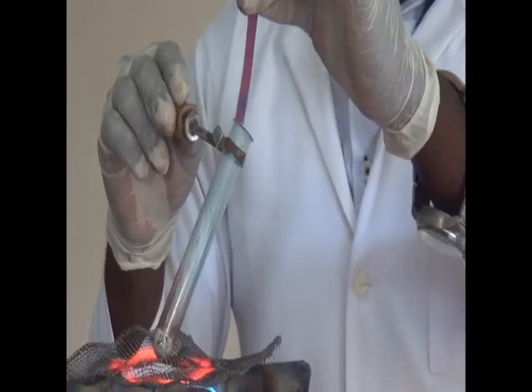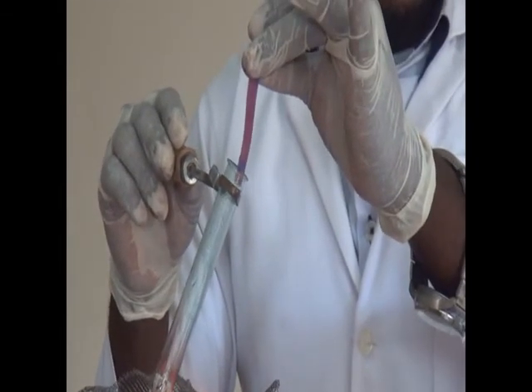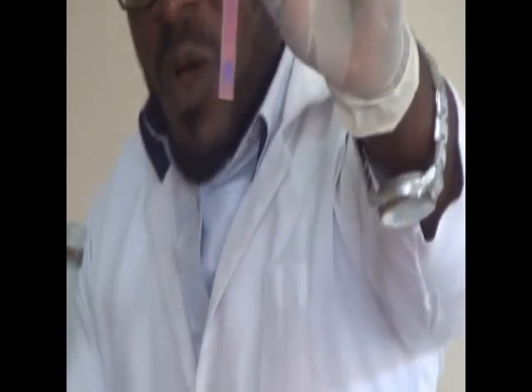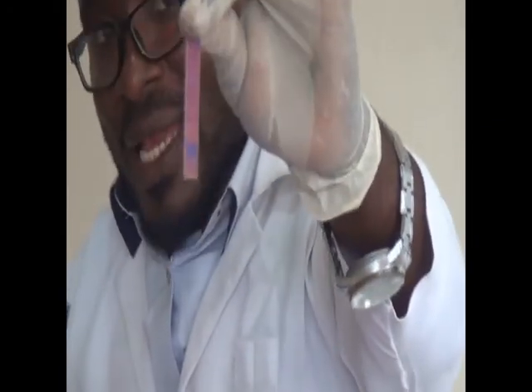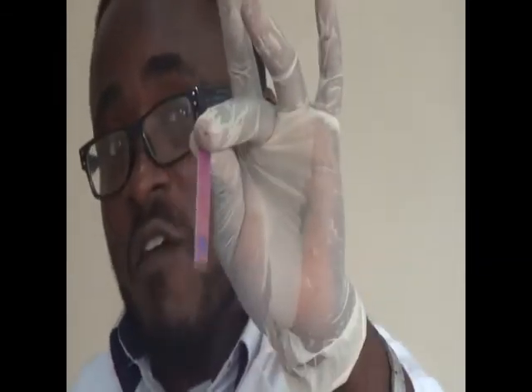Now you can see that the litmus paper changes color immediately. The blue litmus paper has changed completely to red. This indicates a practical test for sulfur 4-oxide gas. It has a tendency to change blue litmus paper to red, indicating that sulfur 4-oxide gas is an acidic gas.